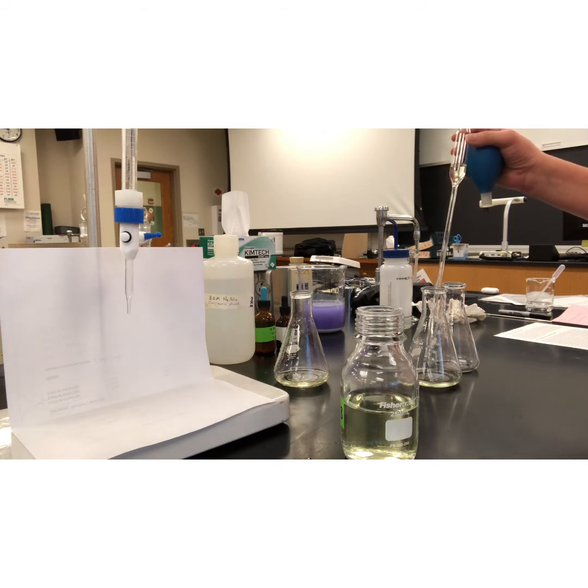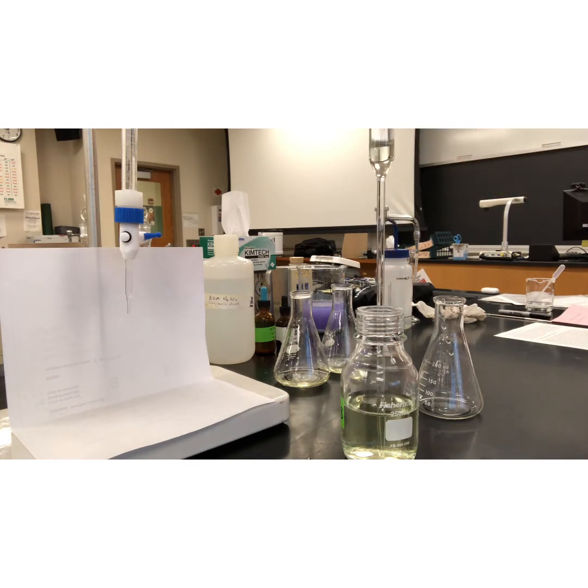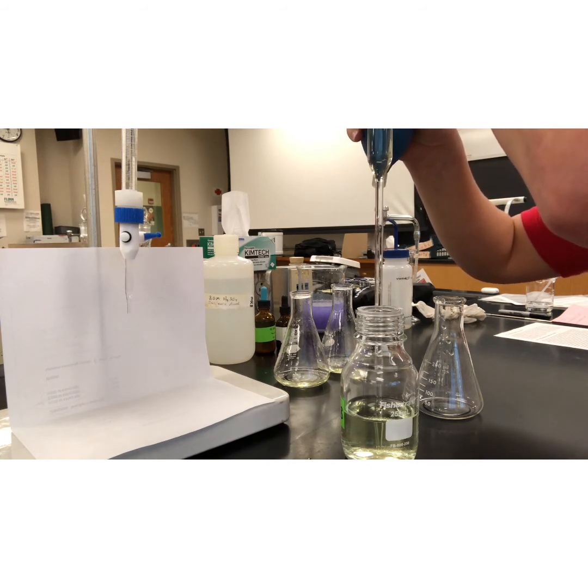Sample number 2. Move out of the way. I can totally see myself not putting the next aliquot into an Erlenmeyer flask that already has one in it. So I move it out of the way to make less room for silly errors. Okay.